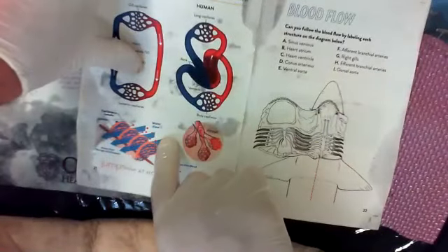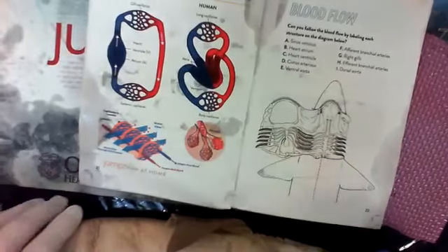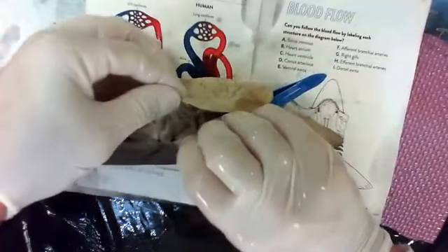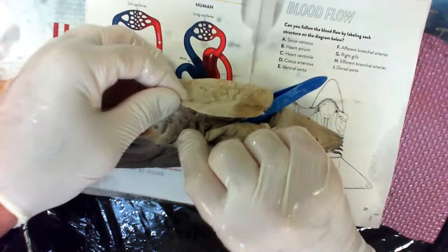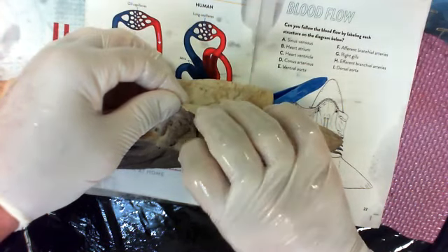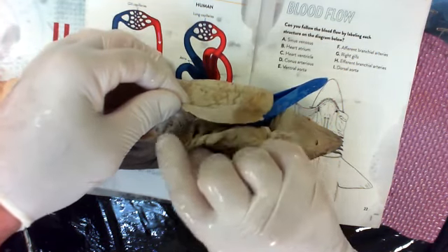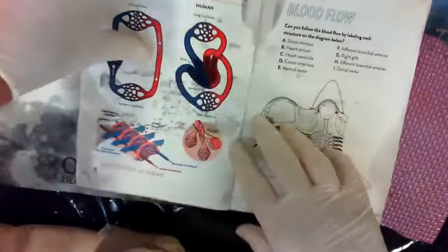Here are the gills. Think about this. So I'm going to the market to buy a fish. And when I get there, I want to know that my fish is fresh. So I take the gills, I pull back the bone, look in the gills. What color should they be if they're very, very fresh? Should they be blue, dark red, or bright red? If you have a fresh fish, they're a bright red color because there's so much blood circulating through the gills. It looks bright red, kind of like that.